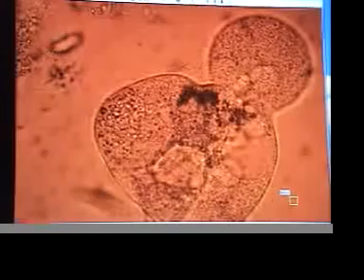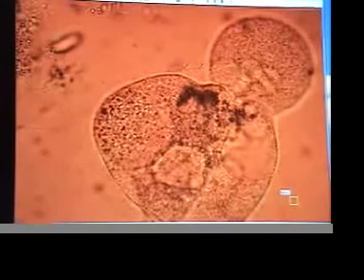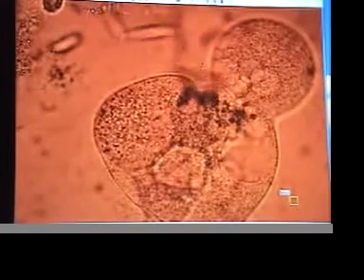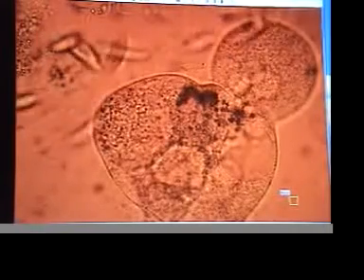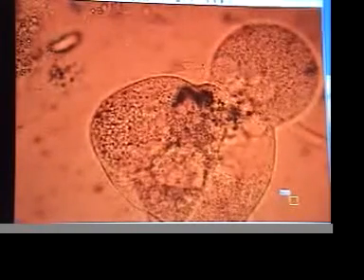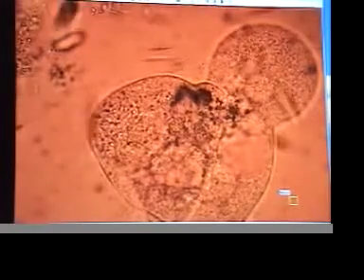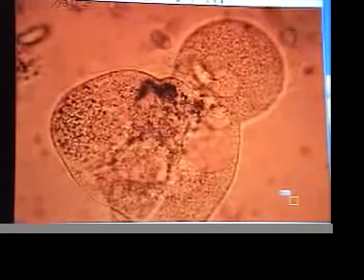This is really interesting because that little sphere, which I would conjecture came from within the organism, is showing continued activity. This is very interesting. But this is a 40x objective, so this would be a little tricky. I need to move that over a little bit so we can center the picture. There we go. Very touchy business.